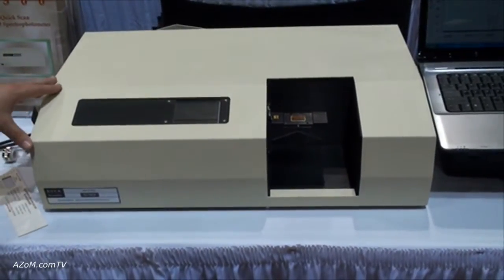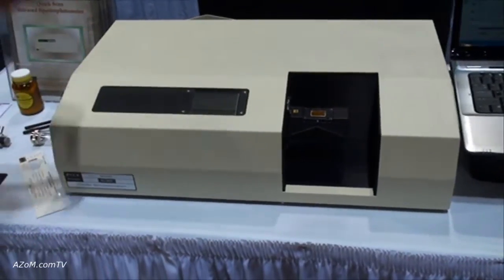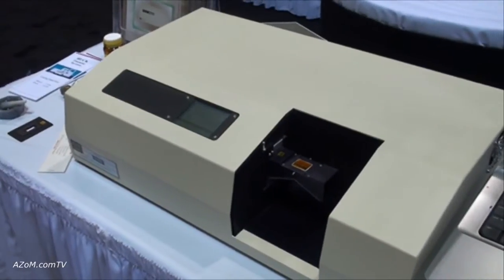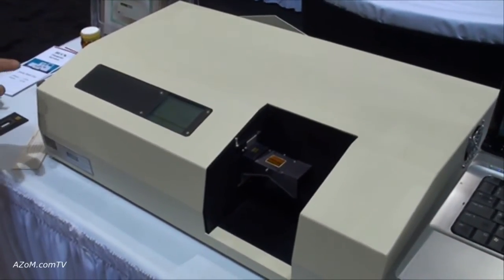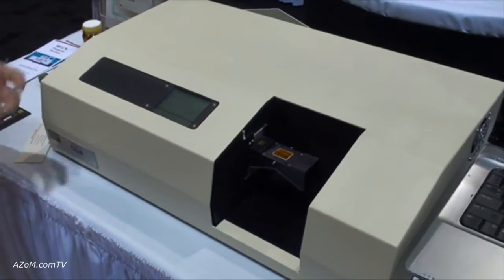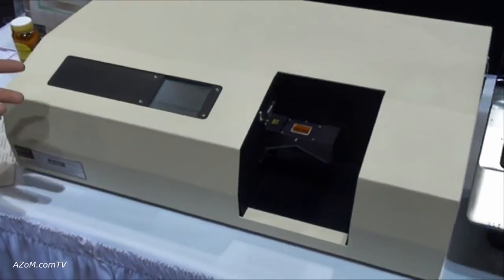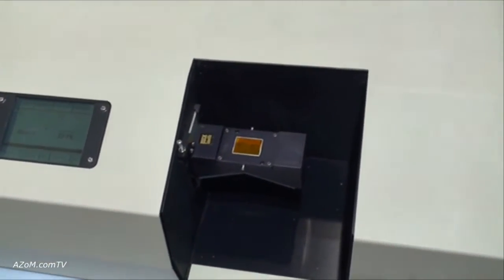Infrared spectrophotometers are normally used for organic analysis. It gives you an idea of the functional groups that are in your sample. This is a dispersive instrument, so it uses a grating and monochromator to scan the wavelengths, as opposed to an FTIR, which does a very fast scan but needs to be kept at very low humidity and certain temperatures.